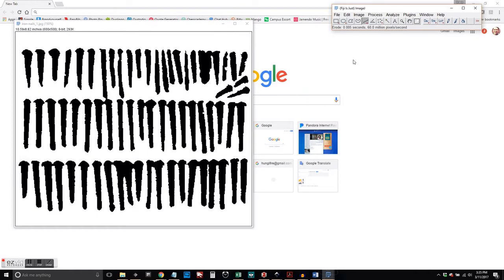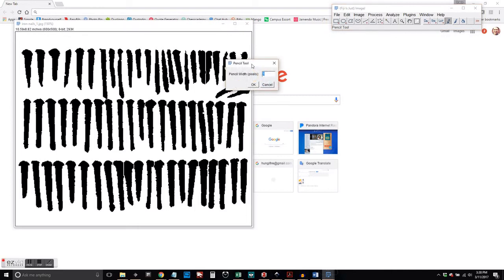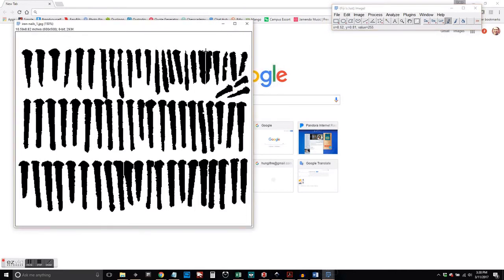So now we've got a lot of nice black objects for us to work with. But you can see that some of them are connected and that's going to skew our results.